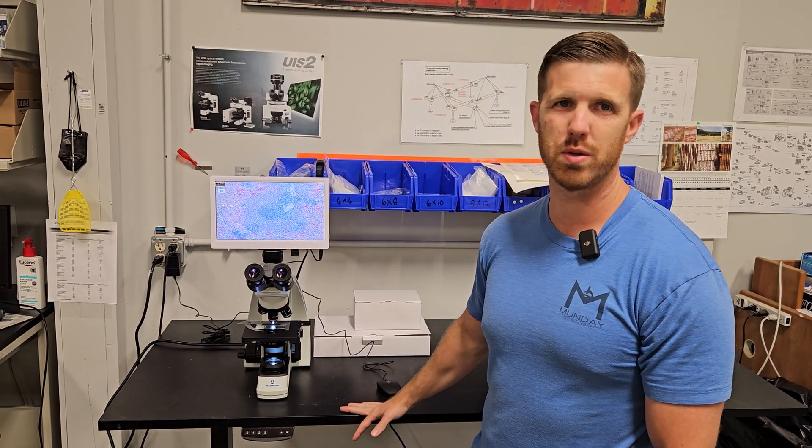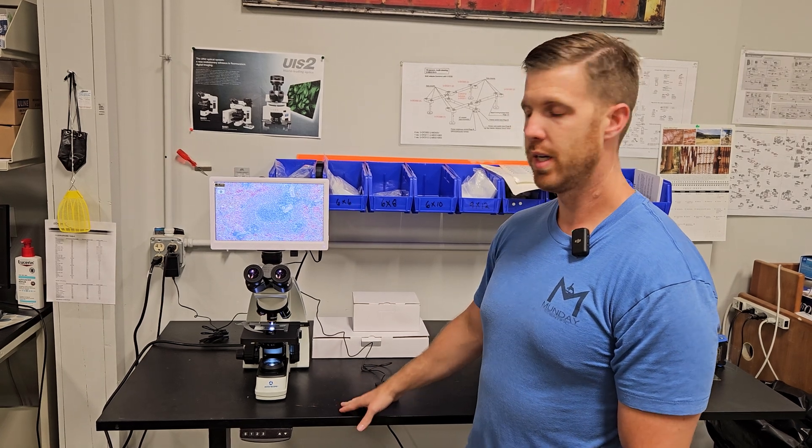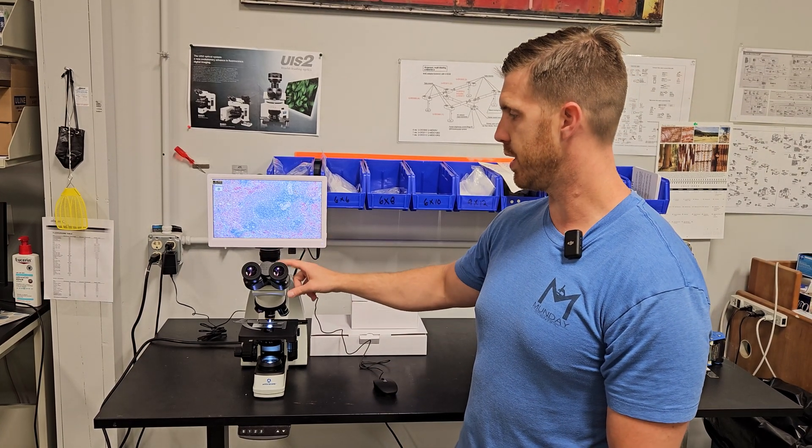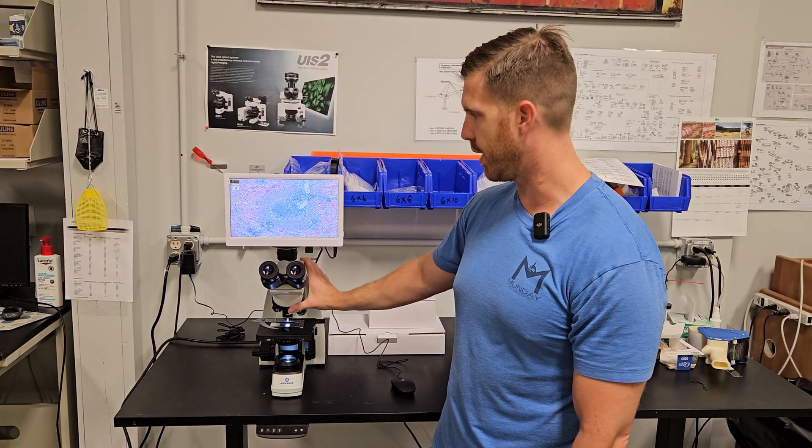Some folks have a hard time looking through the microscope and this is really great for fast checks. This is exactly what you see through the eyepiece. It's a little bit smaller field of view but for the most part it's all there.